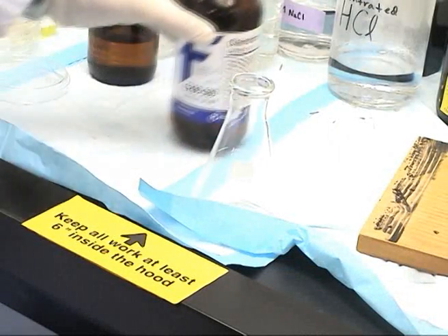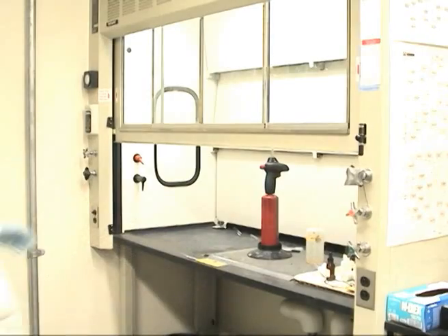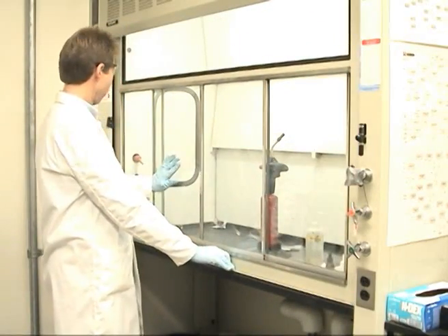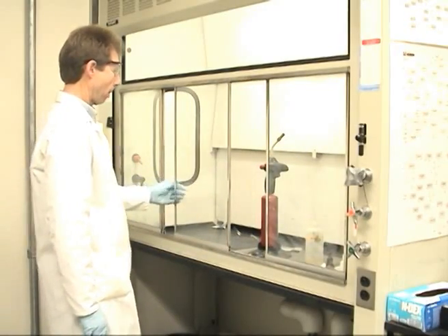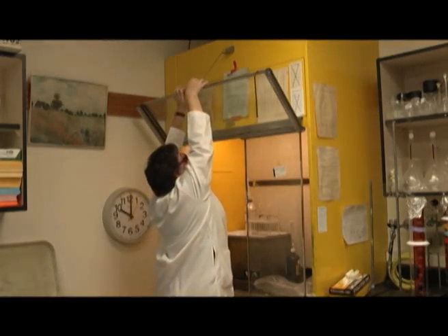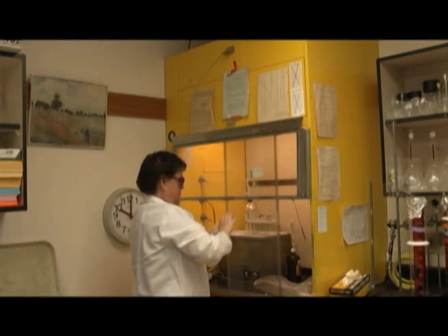Move extra equipment out of your way and always work at least 6 inches from the front of the hood. Some hoods have a combination sash that can be opened horizontally or vertically. In this case, the sash is lowered, then the horizontal sash is adjusted to provide protection from explosive reactions or chemical splashes. In older buildings, fume hoods may have horizontal sliding sashes and a velocity screen to meet the 100 feet per minute inward face velocity.